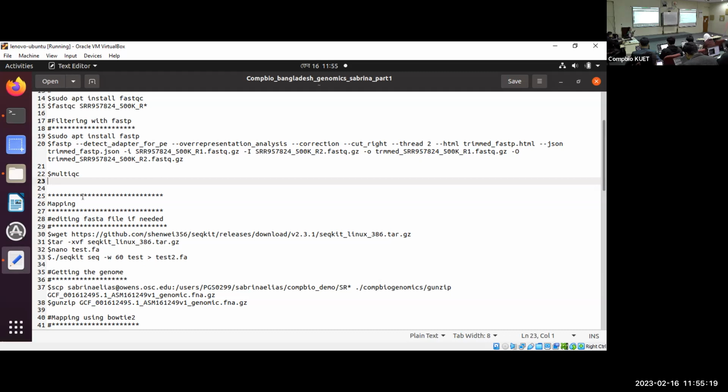So for that, apart from the 2 reads we have, what else will we need? What else can we need apart from the reads? We will need a reference data, good. So we will need a reference genome with which we will map the 2 reads we had.